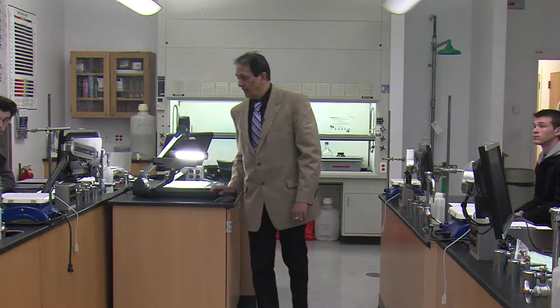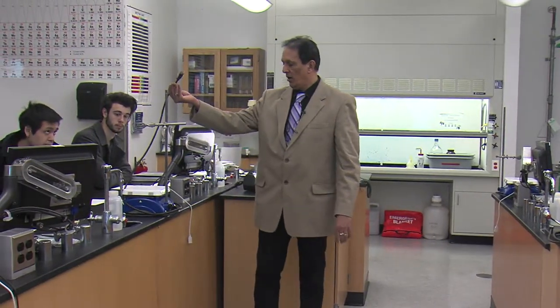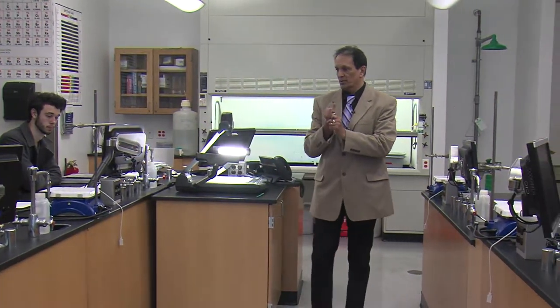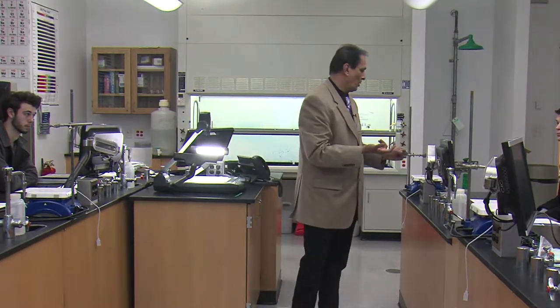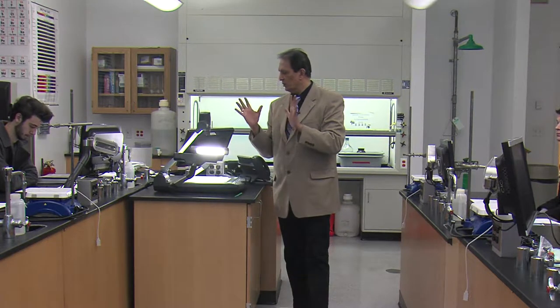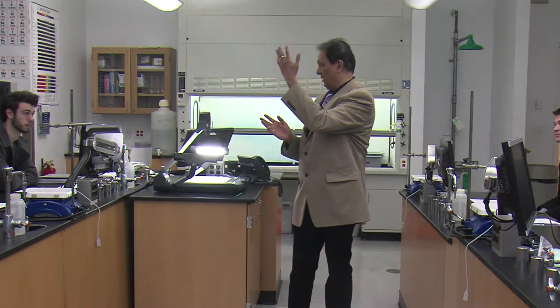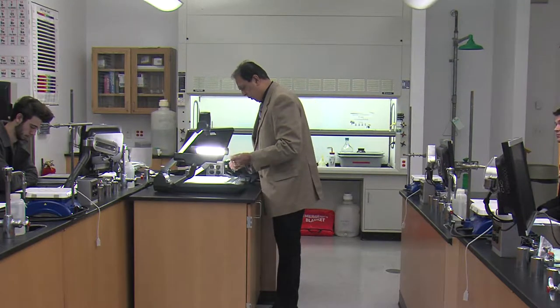Now, as you are leaving, make sure if you are in the middle of the experiment, you pull the plug, all right, on your heater, on anything that you have plugged in, all right, and only carry your valuables, all right, your leather coat, your wallet, your purse, all right. Don't come back for a notebook or don't come back for a textbook and so on, okay. Your iPhone and so on, those are valuables. Only carry your valuables with you. If you're in the middle of the experiment, don't go home from the parking lot, all right? You will have to come back and finish your experiment and then go home.